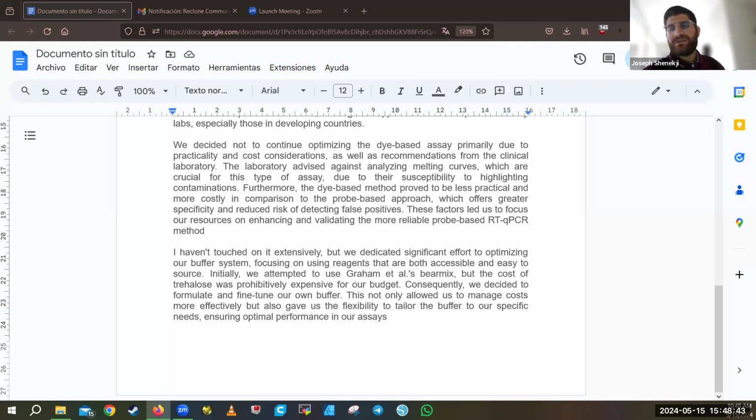do some screening. We don't use sequencing, we make sure that the sequence is right after amplification. But I think the PFU, the SSO7D part could amplify very large sequences. I think that could be applied, and even to trying to produce a whole plasmid, some small plasmids, with ease. So this is what I can share for now, and I hope with further results I can also share with you.